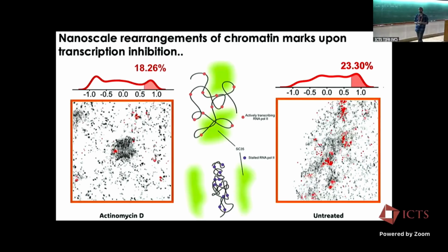Hi, nice presentation. I had a few questions regarding the technique. First, how are you conjugating the nanobodies with the oligos? The nanobodies have a single cysteine, so we use cysteine maleimide click chemistry to attach a functional linker. The linker carries DBCO, and we have azide modified DNA. So it's a two-stage click chemistry reaction.